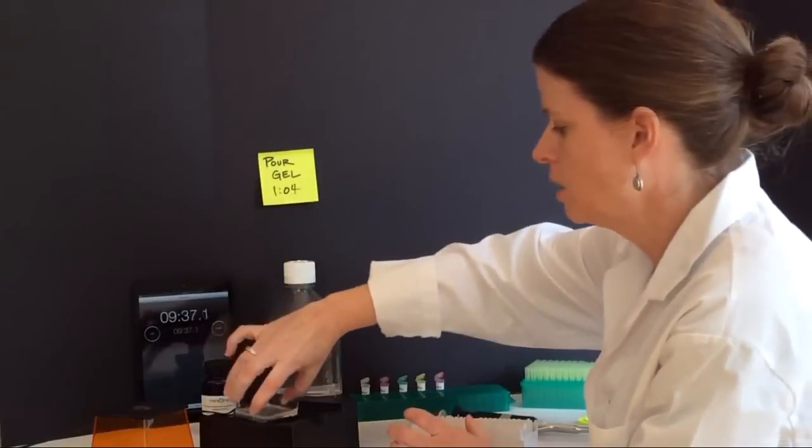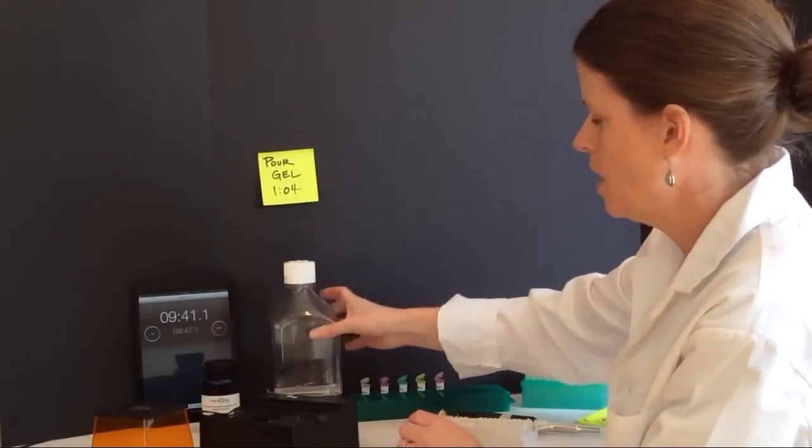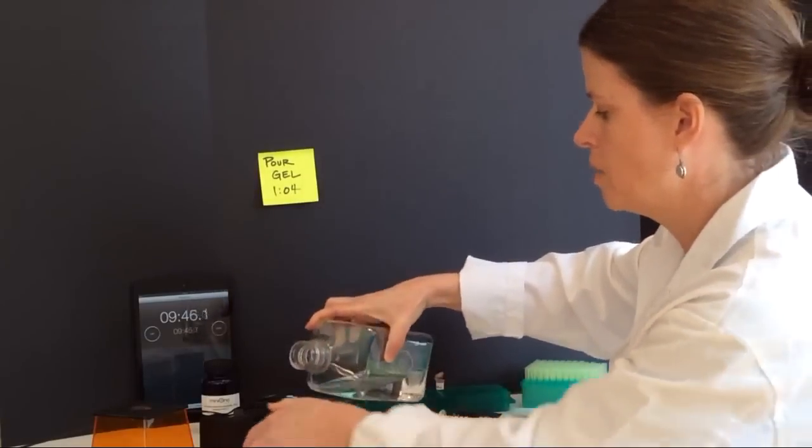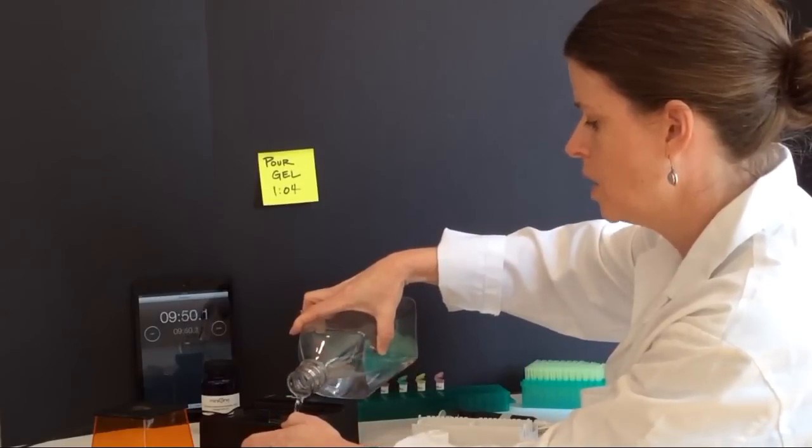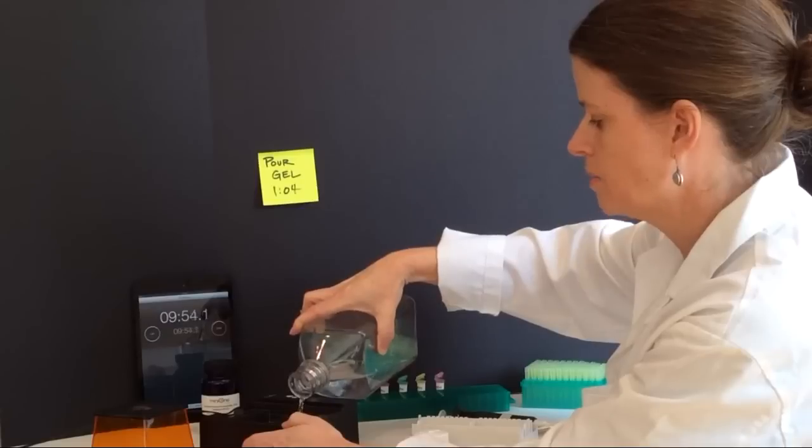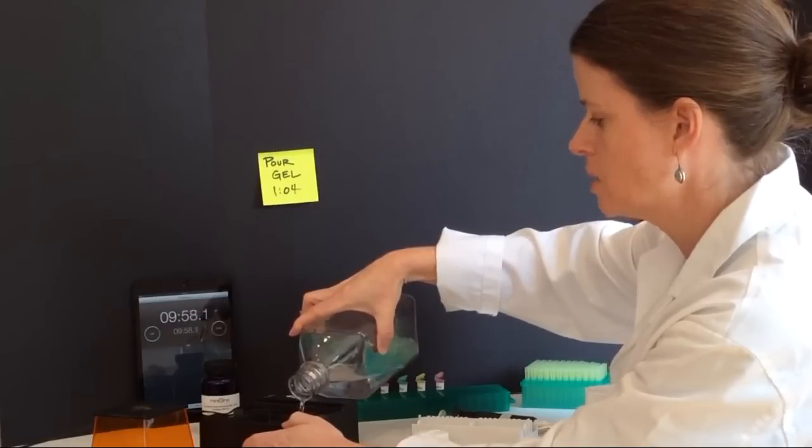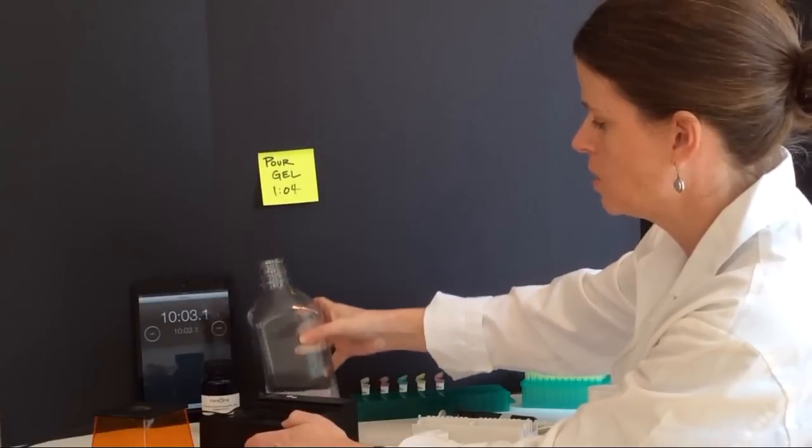Then I'll place my gel into my gel box and then I'm going to add my running buffer. This is a sodium borate running buffer that is provided for you with the kits. It comes as a 20x and then you can dilute it to 1x. I'm going to carefully make sure that I fill both reservoirs of my gel box and that I have a layer of running buffer covering my gel.